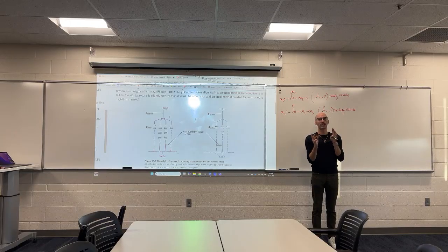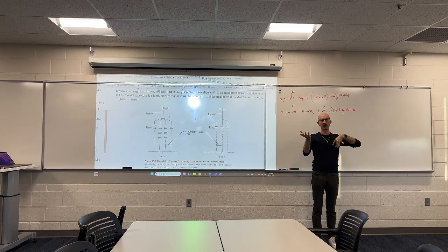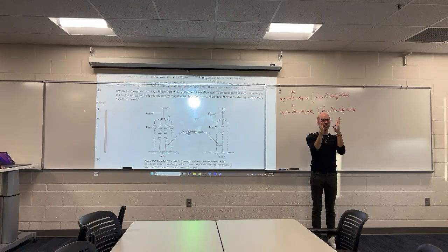And I gave you this crude idea of the nuclear spins all aligning. Think of them as pointing whichever which way, and then they all align, and then they go back down to their ground state. I like that idea because it helps me think about how every hydrogen has a different kind of environment, and again, that shielding and de-shielding that nuclei experience impacts how they interact with the magnet.